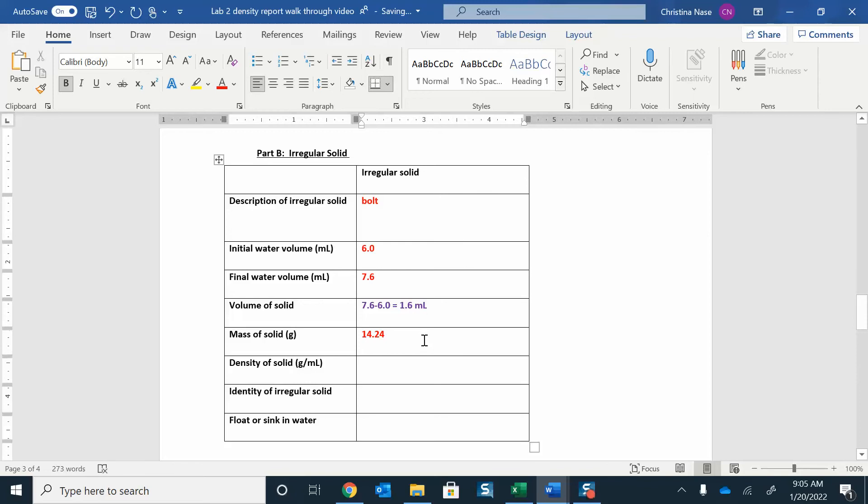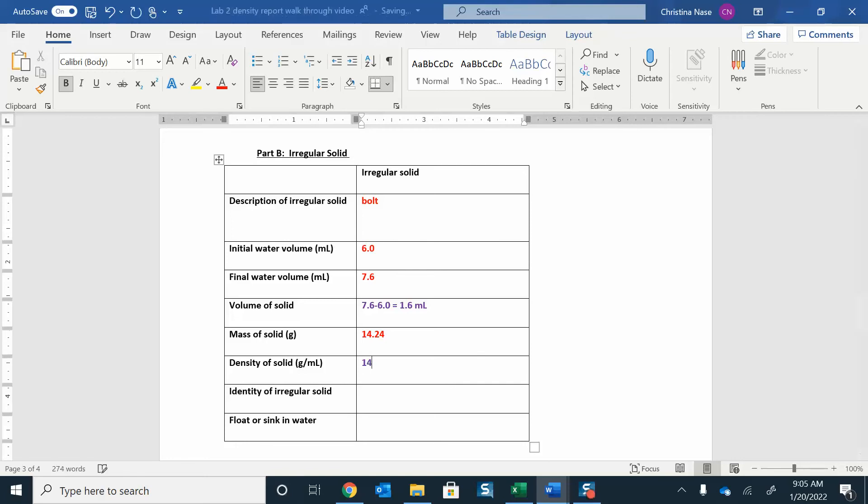So that is what I can assume the volume of my solid is going to be, 1.6 milliliters. I took the mass of the solid, I just put that on the balance. That's what I got in grams. To find the density, I'm just going to do mass over volume again. I'm going to take that mass, 14.24, and divide it by the volume, 1.6. When I worked that out, I got 8.9 grams per milliliter.